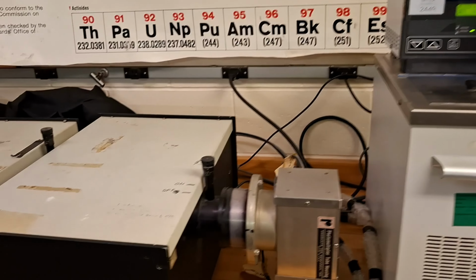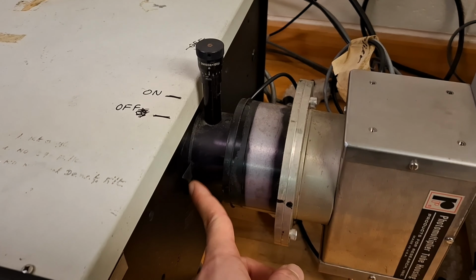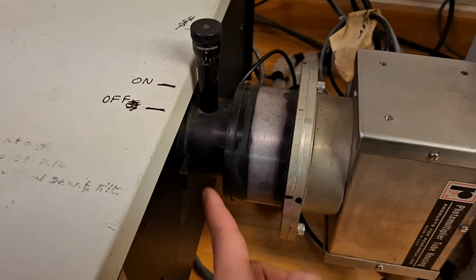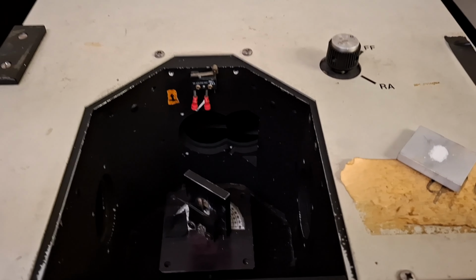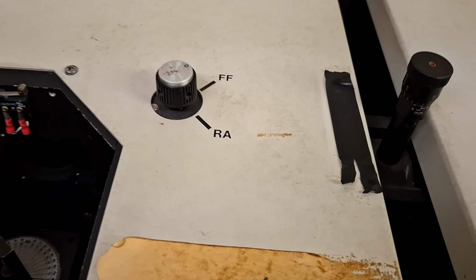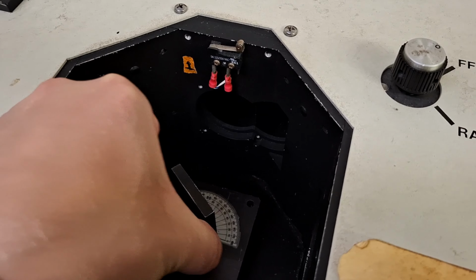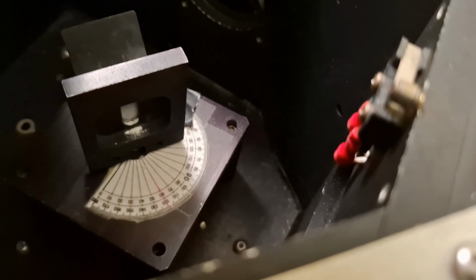But first I have to put my sample inside the spectrometer. So this is my sample. The detector slit is off. I want to protect the detector, therefore it is in the off position, so there is no light for the detector right now. I will put my sample. I prepared it a few minutes ago. So I put my sample, so you can see it is there.